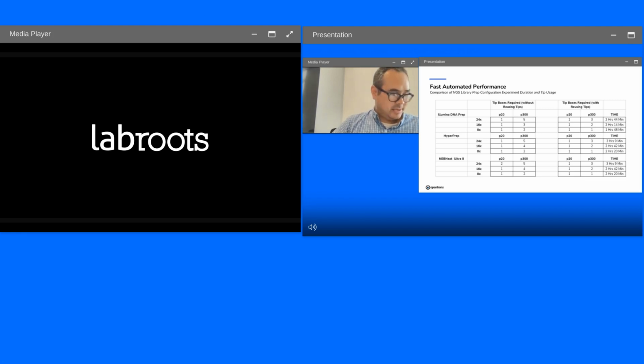So this tip reusing is sort of an ease of use feature that a user could program into the script to reuse tips. It takes advantage of the bot being able to keep track of these tips and their positions, versus you can do it by hand, but it's an additional headache. This is particularly reusing tips only for the ethanol washes, or in the case of Illumina, for the tagmentation bead washes. I would switch out a reservoir and use a deep well with individual wells for each tip, so they would keep clean and there would be no cross contamination.